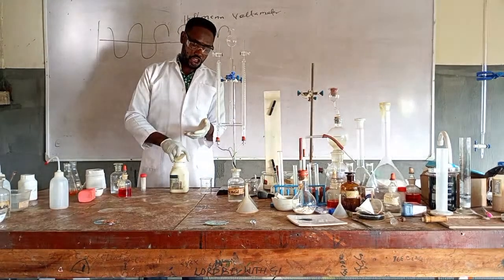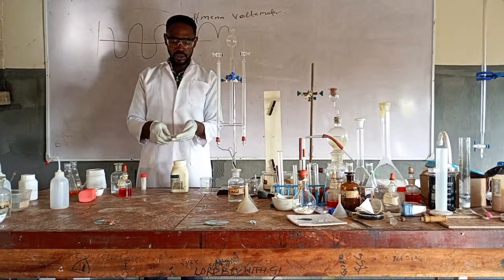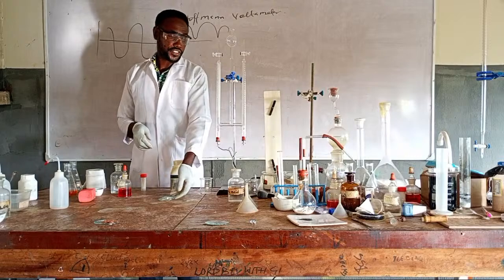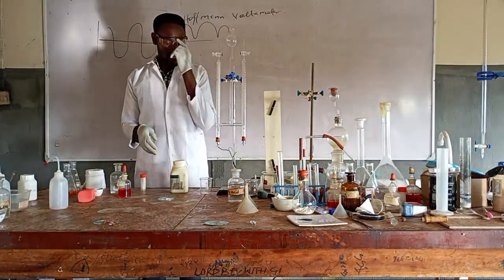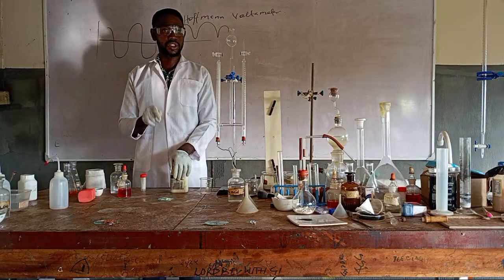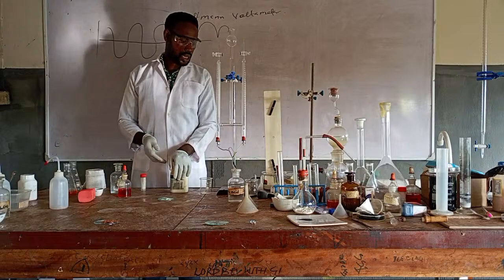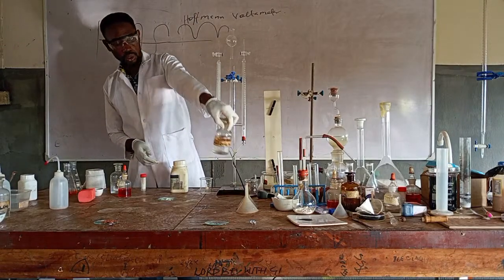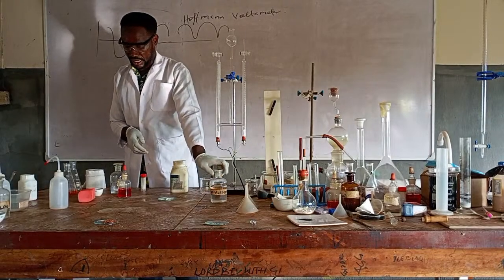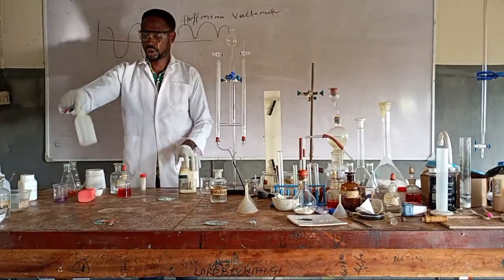If I want to change this back to the blue, what do I do? I'll add water. If I add any other liquid that is not water or does not contain water, it will not turn blue. It is only sensitive to what? Water. So this reagent here will turn it because it's aqueous, there is water in it. Remember, the test is only sensitive for detecting water, not detecting pure water.